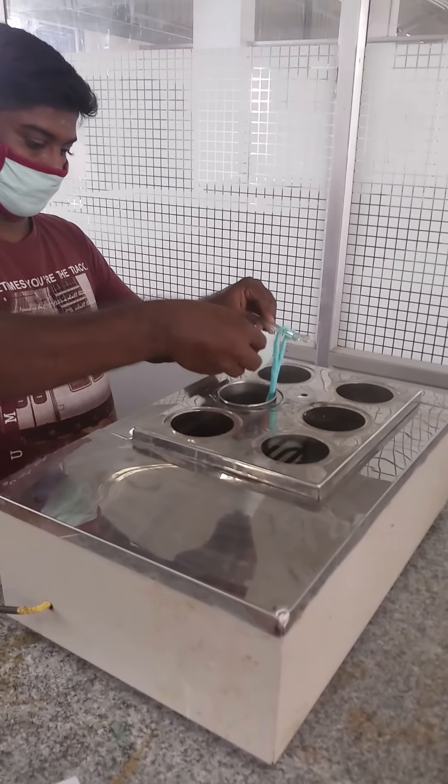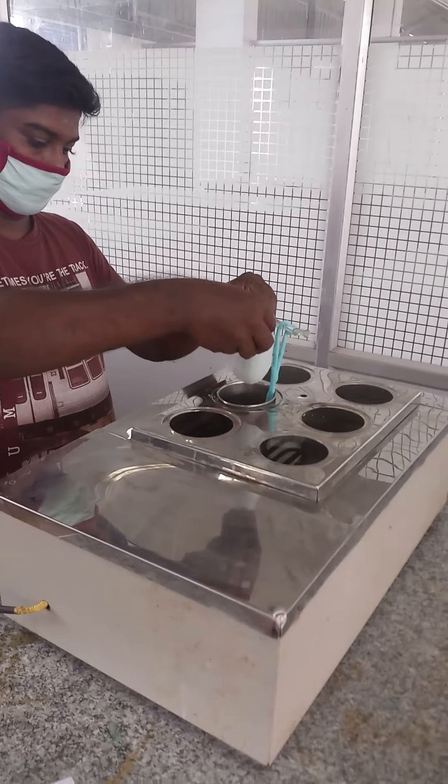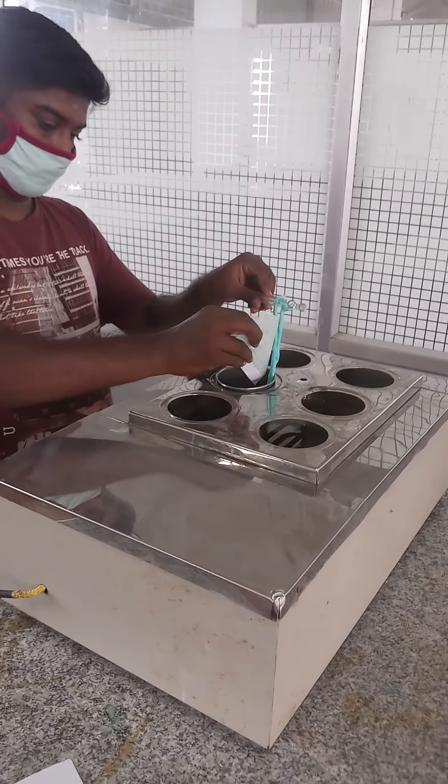Half the amount of sodium chloride and sodium hydroxide is to be added to the dye bath, and dyeing should be carried out for 45 minutes.